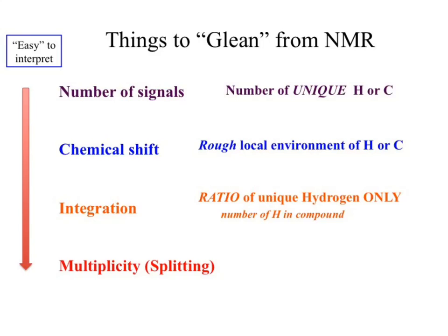And remember the ratio. Theoretically, if everything is nice and there's very little symmetry, you can add the ratio together and you would get the number of hydrogens in your sample. Okay, the perfect amount. But again, remember, this is theoretical. You're looking at a sample that has maybe 1,000 different molecules in it. Every single hydrogen in that 1,000 sample molecule gets counted by the instrument. Okay? So you can only pick up the ratio of them, not the exact amount.